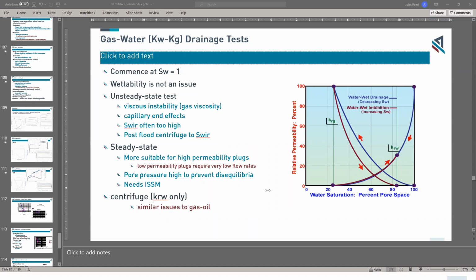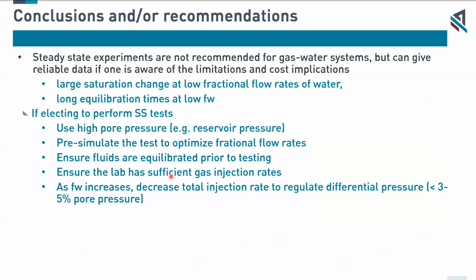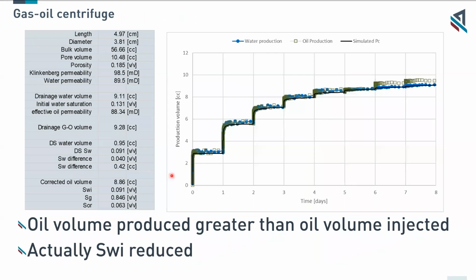There's one that says, how did you measure saturation in the figures I showed? Yes, there are a variety of different ways. If I go back to this, this is a centrifuge. In the centrifuge process, we have a camera fitted to the centrifuge, which is monitoring a small production window so that we can see the changes in interface between fluids in that window. So that allows us to monitor there.